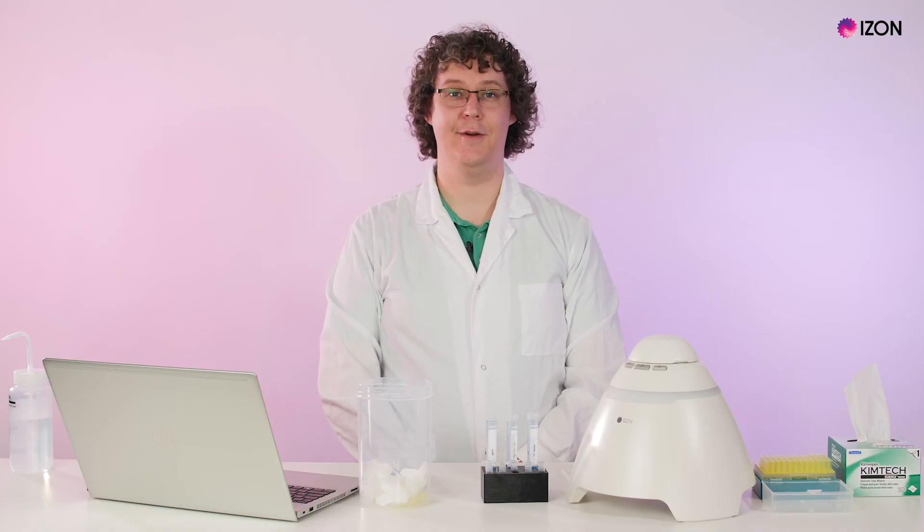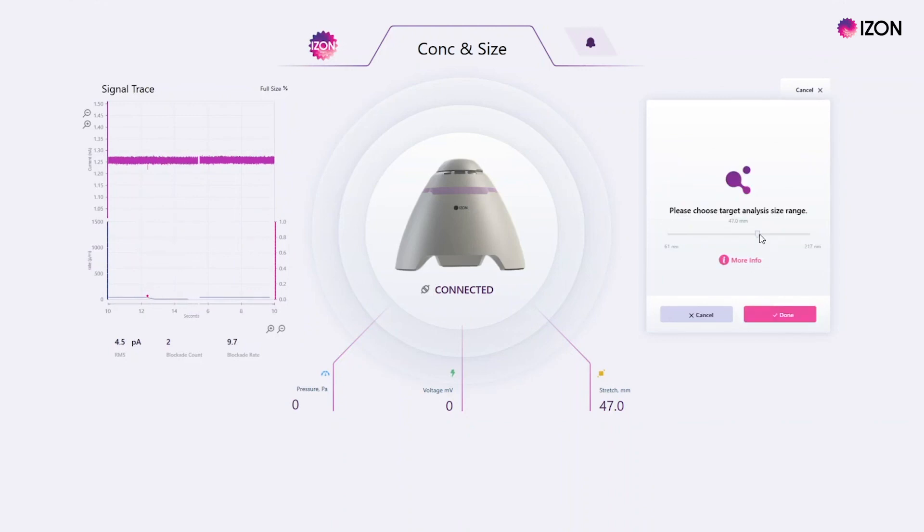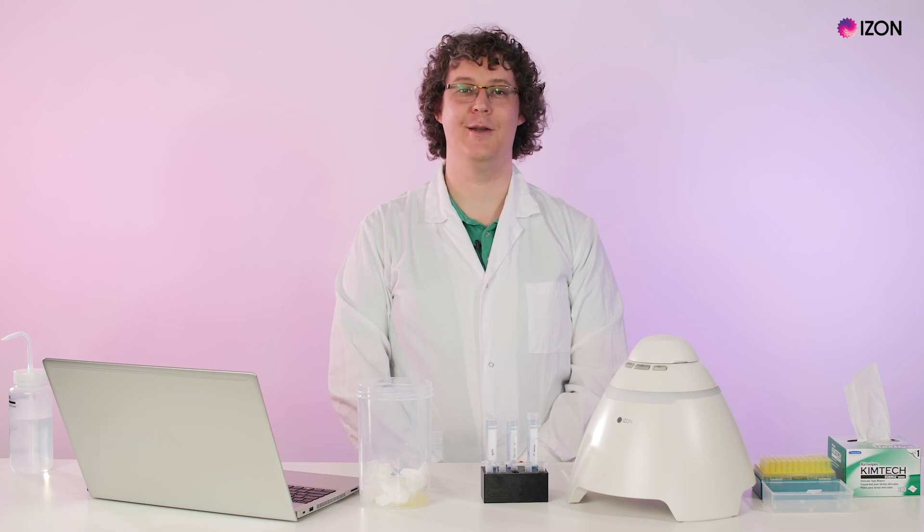The Exoid is now ready to perform sample analysis. If you have completed the nanopore setup, a slider to choose your target size range for analysis will be available once you have chosen which analysis you would like to complete and entered your sample details. Please contact us at support@izon.com for more information or if you have any questions.